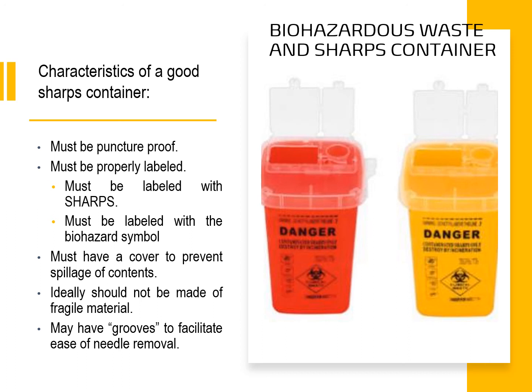Next, it ideally should not be made of fragile material. Okay, most of the time, our sharps container are made of plastic, but again, the container must be puncture proof. And it may have grooves to facilitate ease of needle removal.